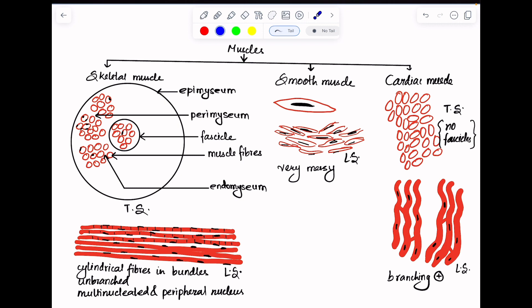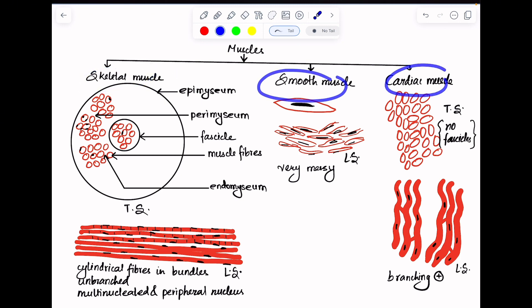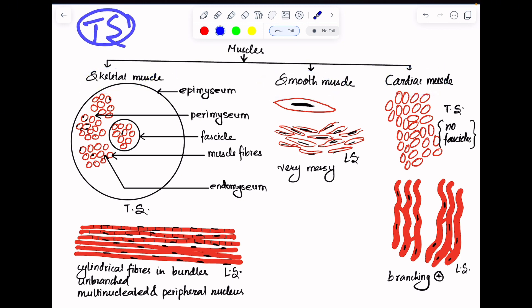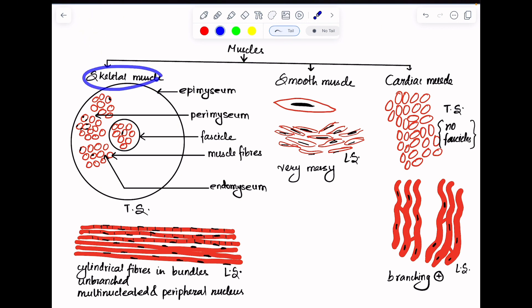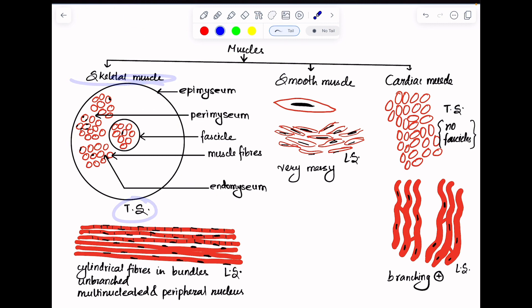We are going to look at the longitudinal section of skeletal muscle, smooth muscle, and cardiac muscle, and we are going to look at the transverse section of skeletal muscle and cardiac muscle. First, let's look at the transverse sections. In the transverse section of skeletal muscle under a microscope, you will be able to see skeletal muscle fibers that are arranged in bundles.